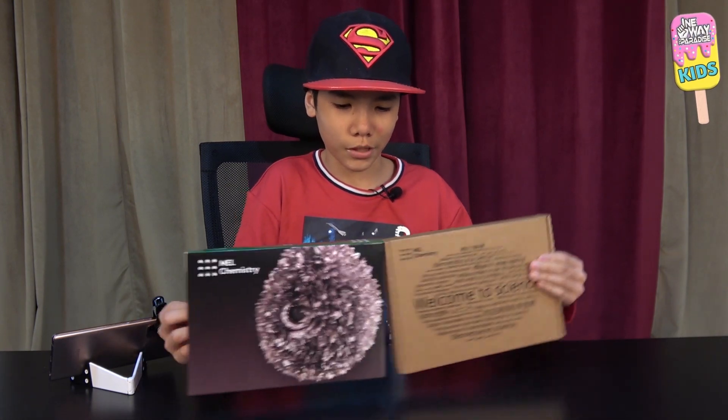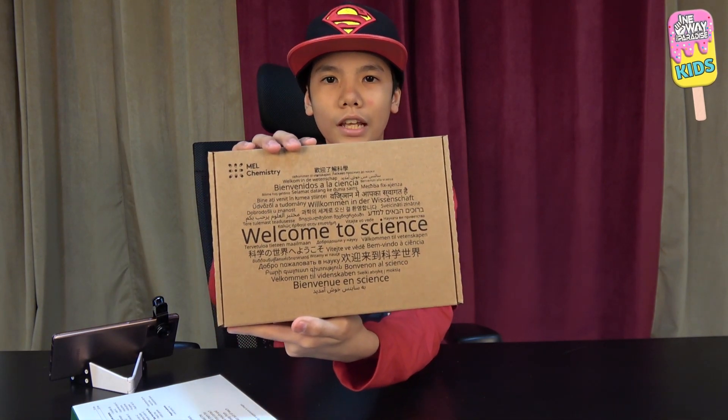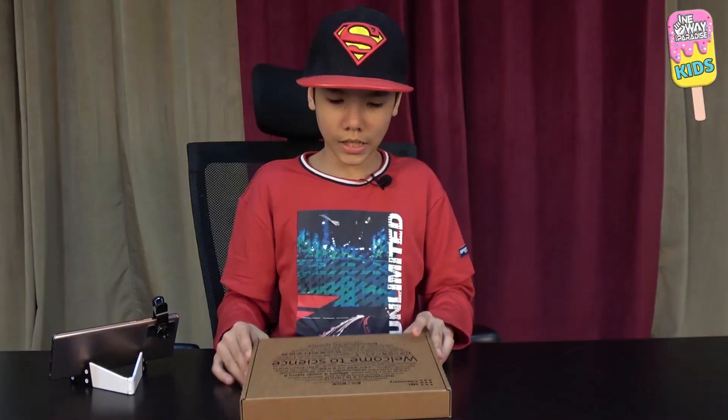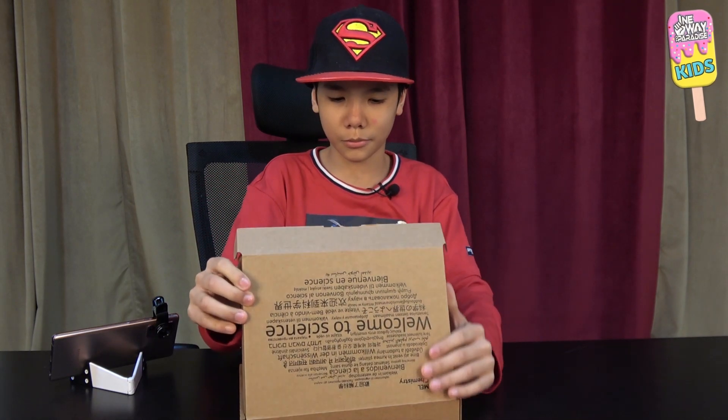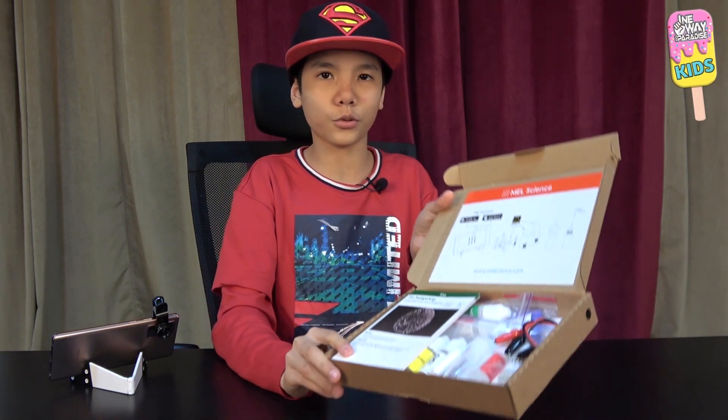If I can open it, and it has welcome to science in all of the languages possible. Anyway, let's open this thing and then we will switch views when we start doing the experiment. Whoa, that's very very cool.